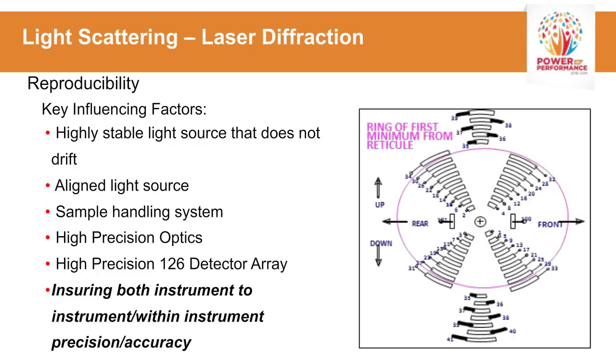As I said earlier too, you might have angles as low as under 0.02 degrees and out to as far as 145. But when you're dealing with particles, let's say 50 microns and above, these low-angle detectors are extremely important, and the ability to align that laser is very important.